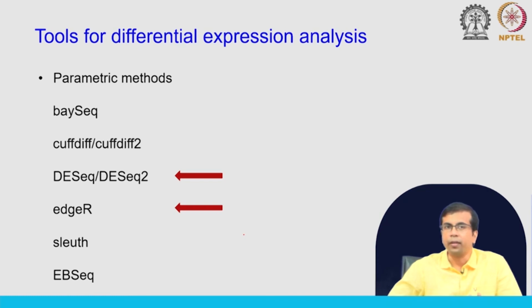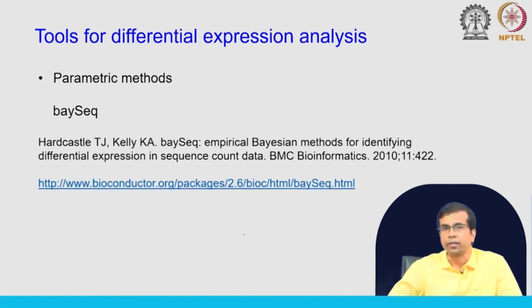Out of these tools, I will discuss DESeq2 in a lot of detail. We will talk about the steps, so you will understand how this analysis works, and I will also mention edgeR briefly. These are the two most popular tools for differential expression analysis. For the rest, I will just give you the references so that you can look them up and read.